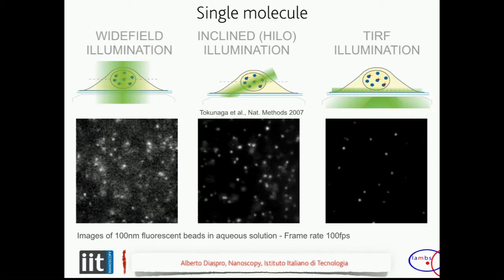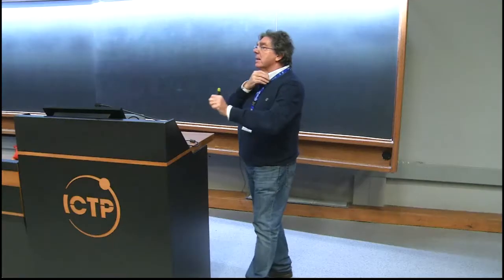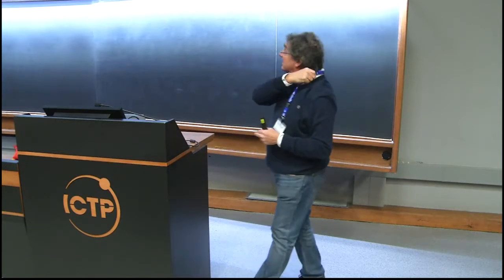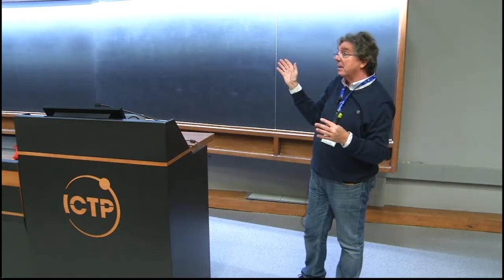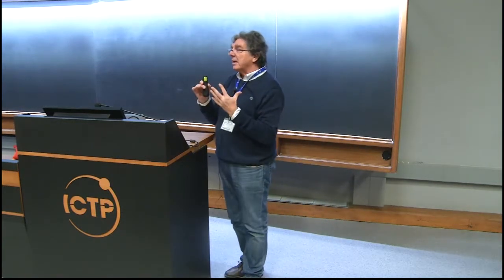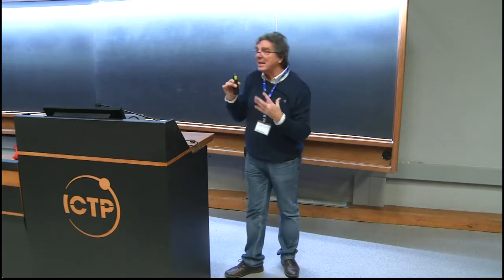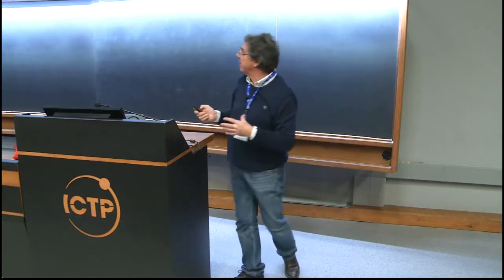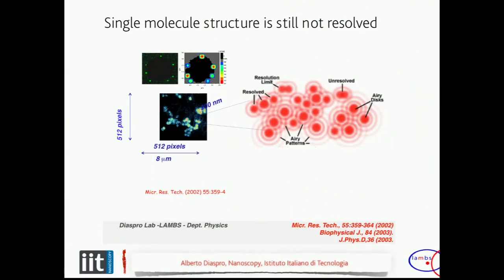Now, this is a condition where the density of the single molecules is not very high. Do you have any tool or any idea for understanding if you are dealing with a single molecule or not? Because when you have them, in this case, the structure is not resolved, but you are always within your diffraction limit.